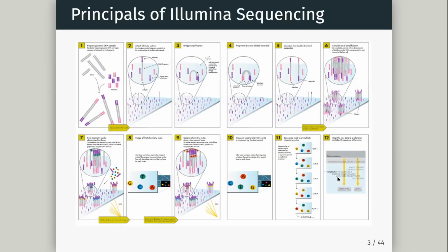With Illumina sequencing now, you're going to get up to 1 billion reads on a flow cell, whereas originally we were only doing, say, 8 million with the early ones, maybe 2 million. So we can really pack a lot of clusters now onto these flow cells. Actually, the accuracy, so how well we know that this is really red, that's what tells us how well we've sequenced a particular base.